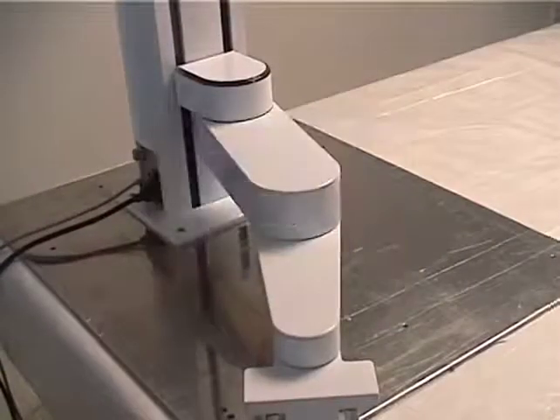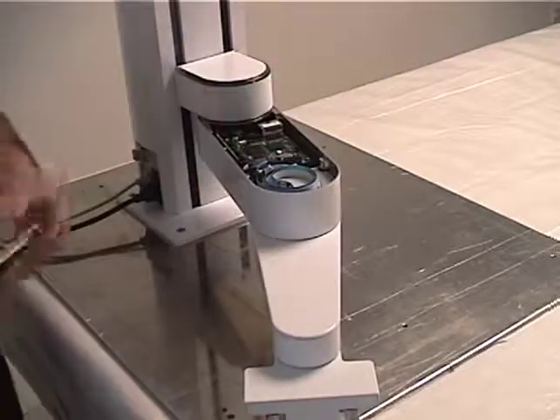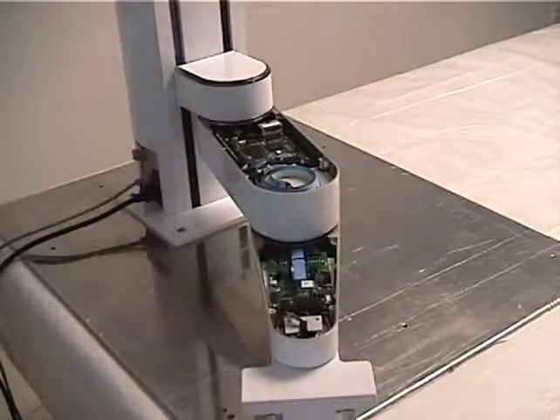There are no external controller cabinets or wire harnesses, because the controller and harnesses are built into the robot structure. This results in an extremely small footprint and a unique space-saving design.